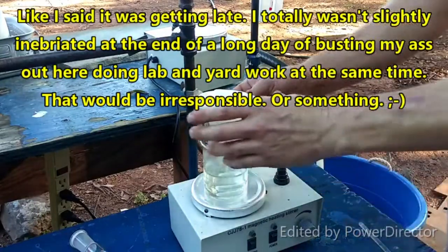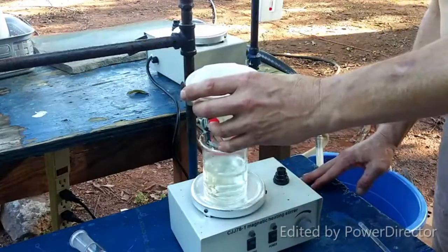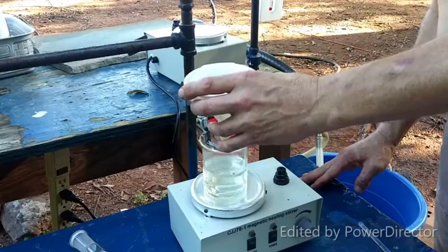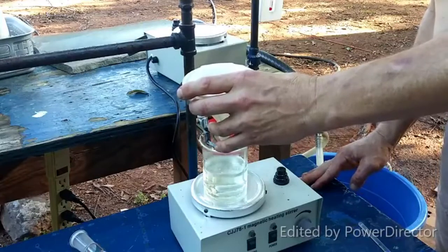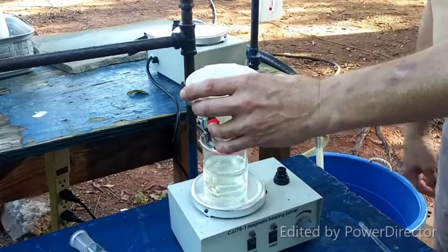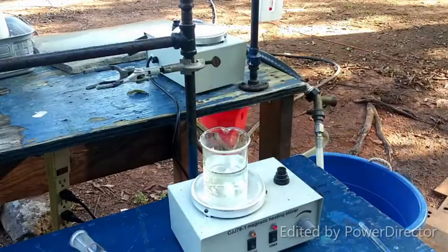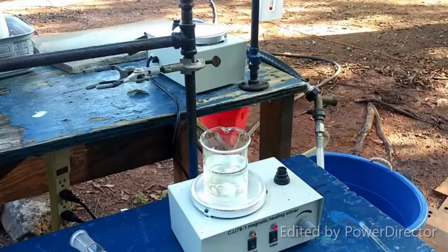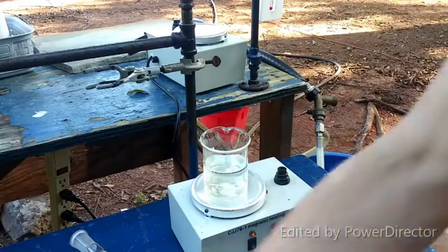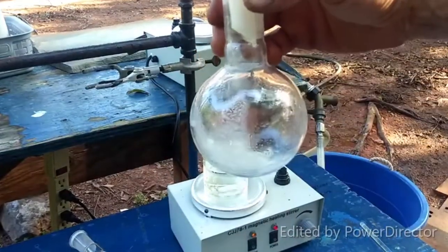I didn't want it cooling off very much and I don't have a jacketed filter to keep it nice and hot, so we'll just have to accept the lower yield. It does have a slightly yellowish tinge to it, so maybe that's a good sign. There isn't as much residue as I thought there would be in there — it's not terrible.